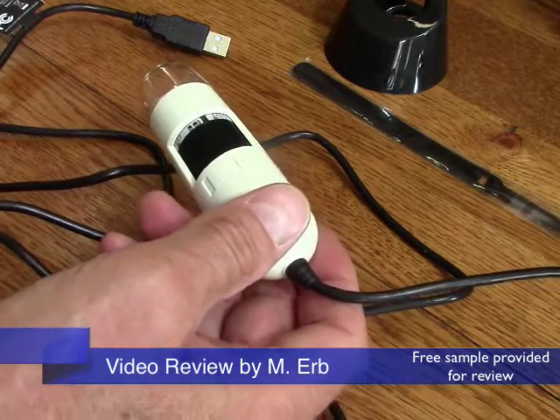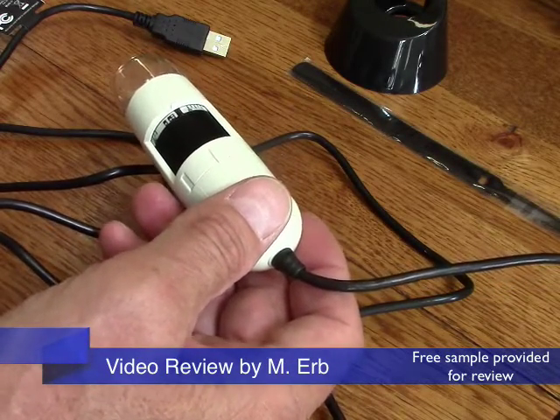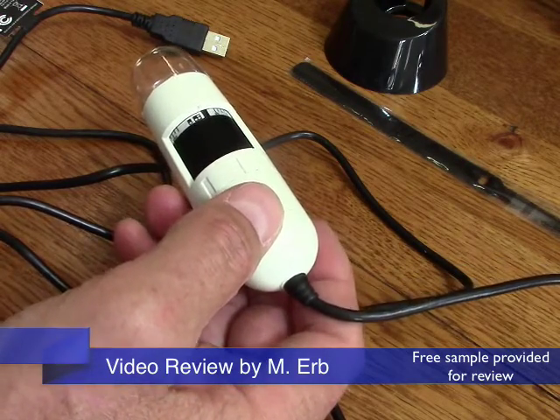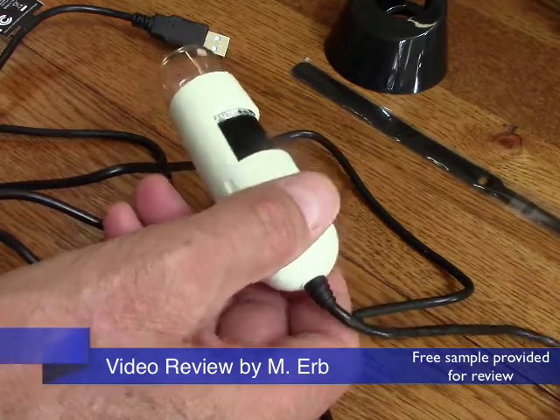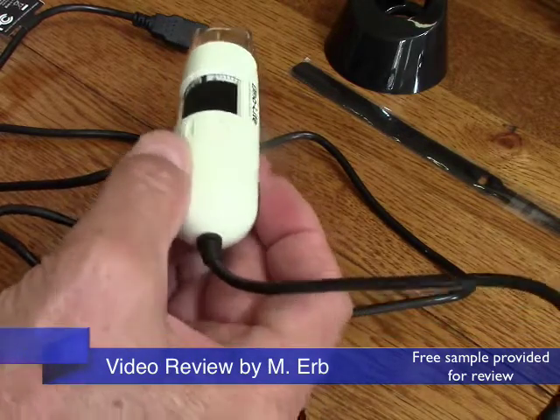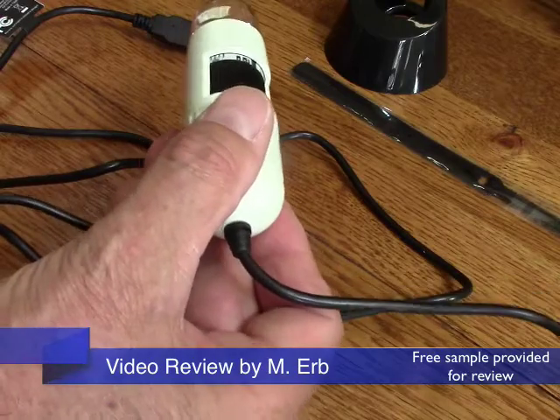Hi, this is Michael and this is my review of the Dynolite Digital Microscope. The model of this one is the AM2111. It's a very handy USB digital microscope and it's pretty amazing really for the price of this.